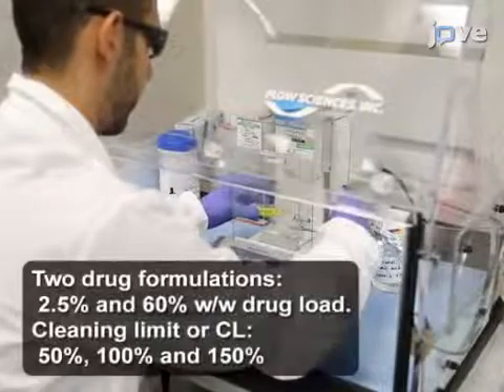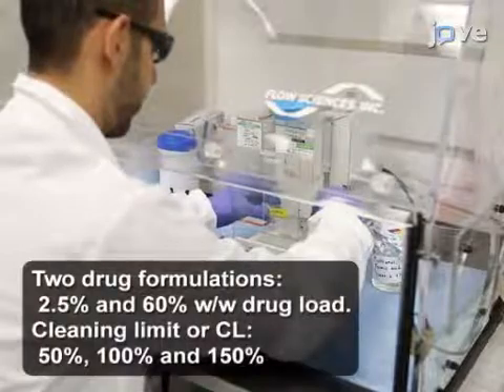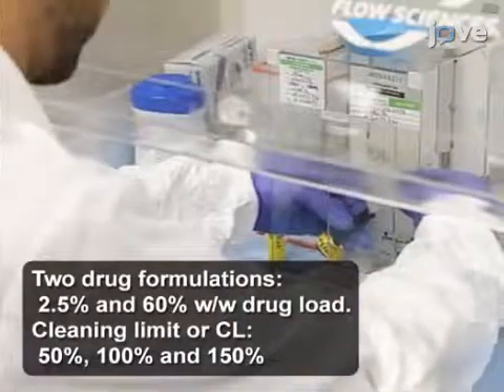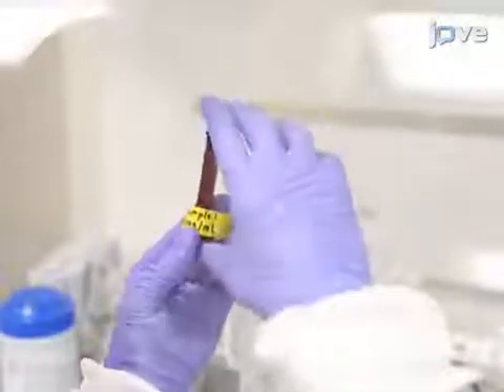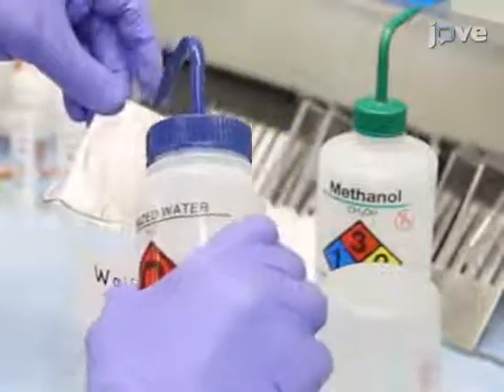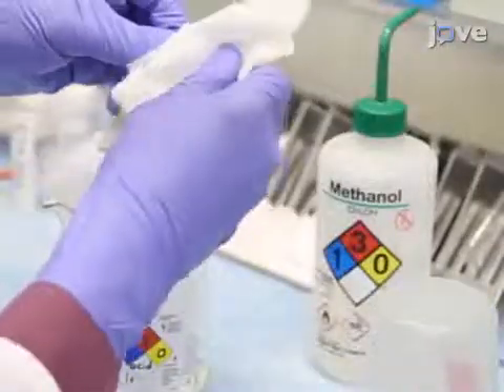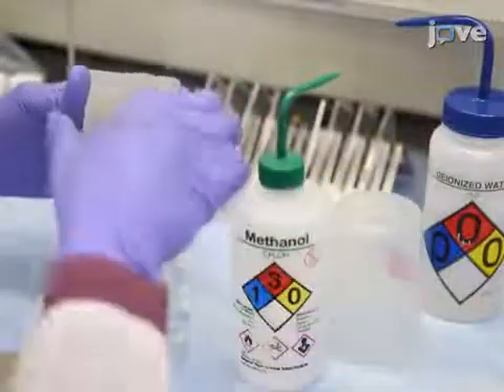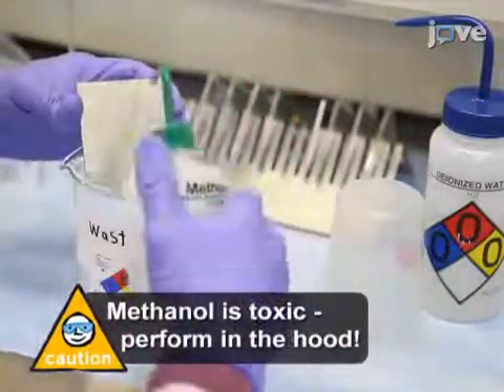To start this experiment, prepare sample solutions of the drug dissolved in the diluent of choice. After calculating the cleaning limit for a drug, clean the stainless steel coupons by rinsing with water and wiping the surface twice for 10 to 15 seconds. Then repeat this rinsing and wiping step with methanol to eliminate any residual deposit.